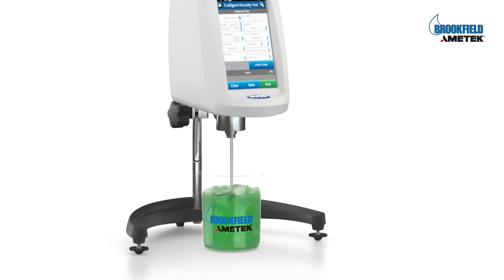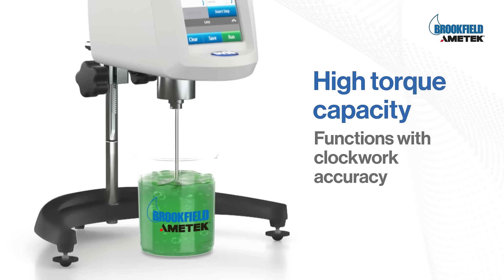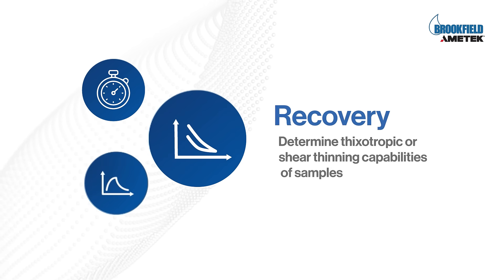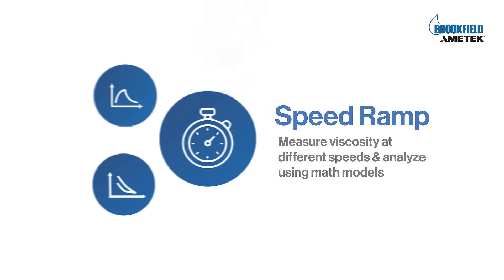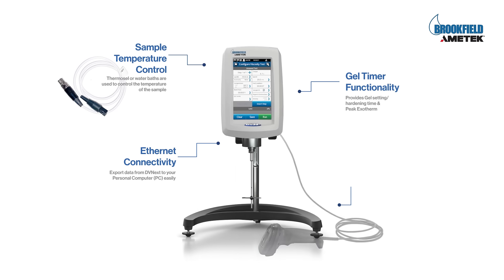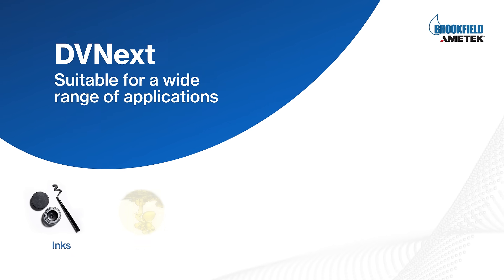It doesn't matter how thick your product is — the DV Next can handle it. It perfectly measures the sample's viscous drag and gives you the exact results. It also analyzes various characteristics such as yield stress, recovery, and speed ramp. Other notable features include gel timer functionality.